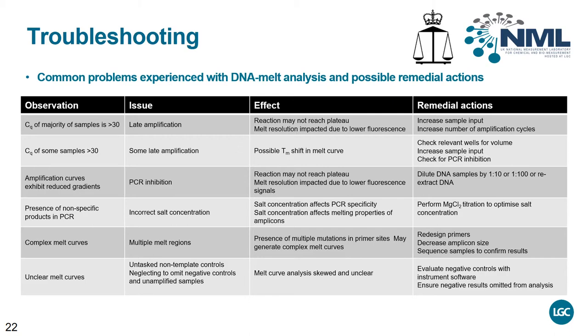Unclear or non-specific melt curves, characterized by curves consisting of zigzag lines, may occur when negative PCR controls have not been correctly designated during data analysis.